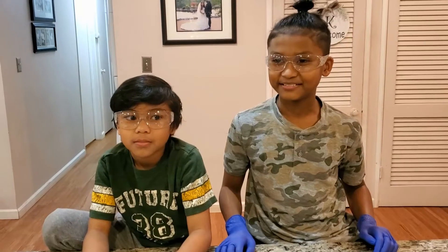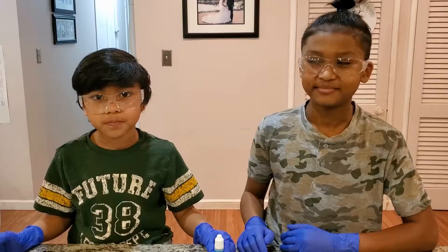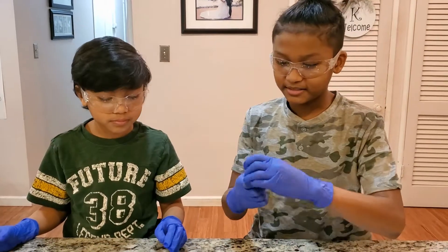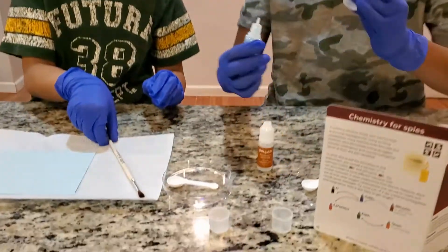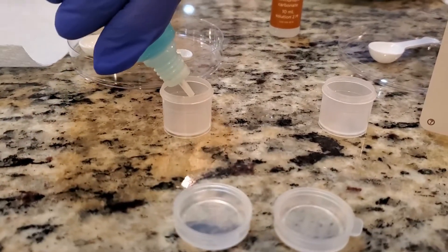Done! Make sure you have gloves and goggles. The blue is copper sulfate. We're going to pour it in these capsules to the line, and then we're going to use it to write the secret message.